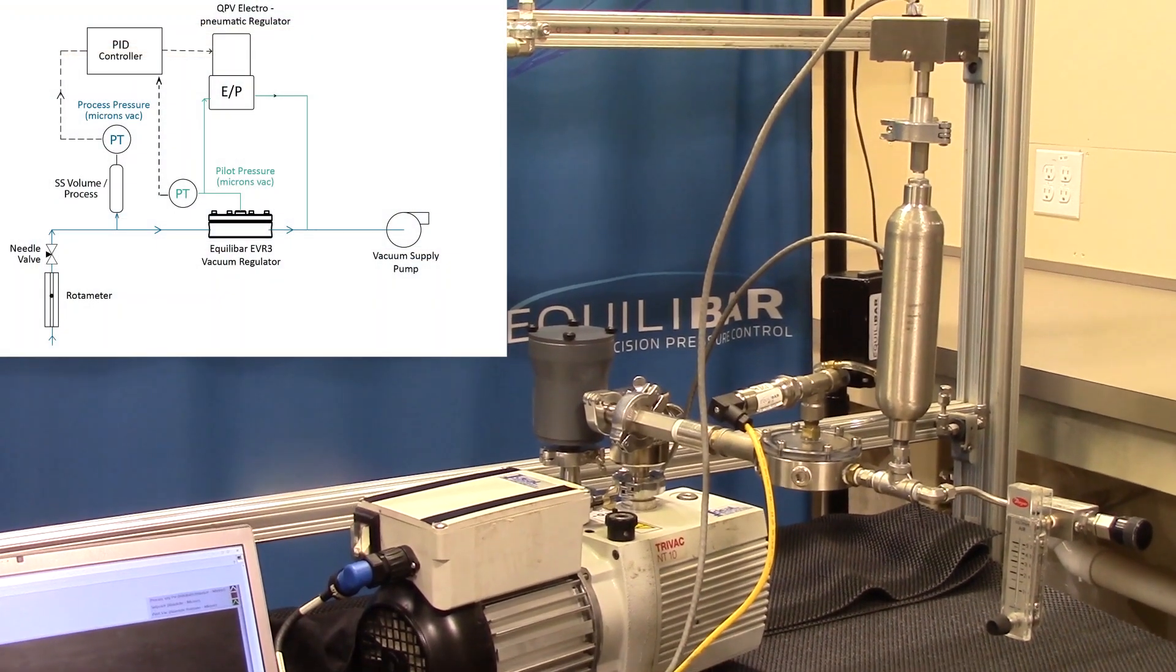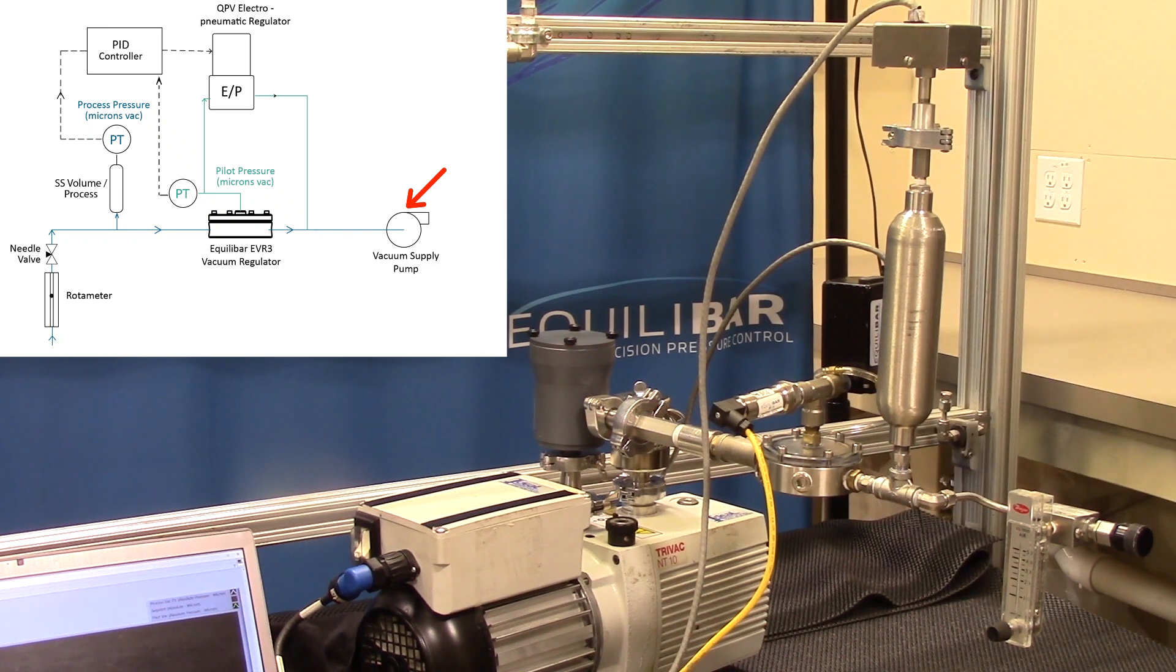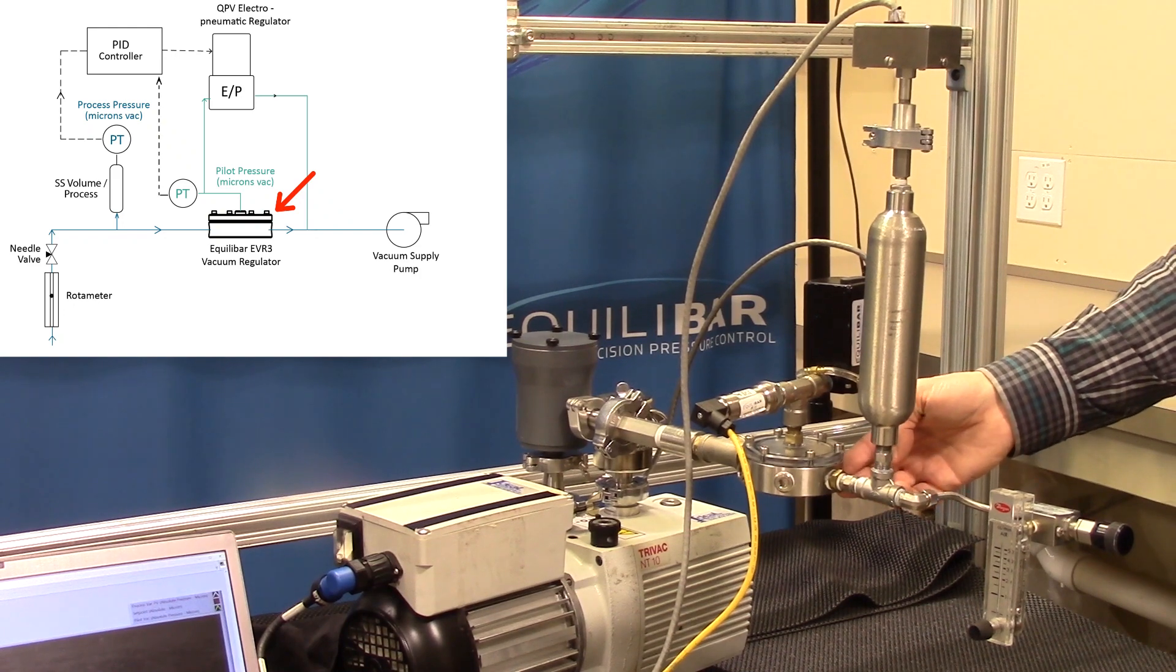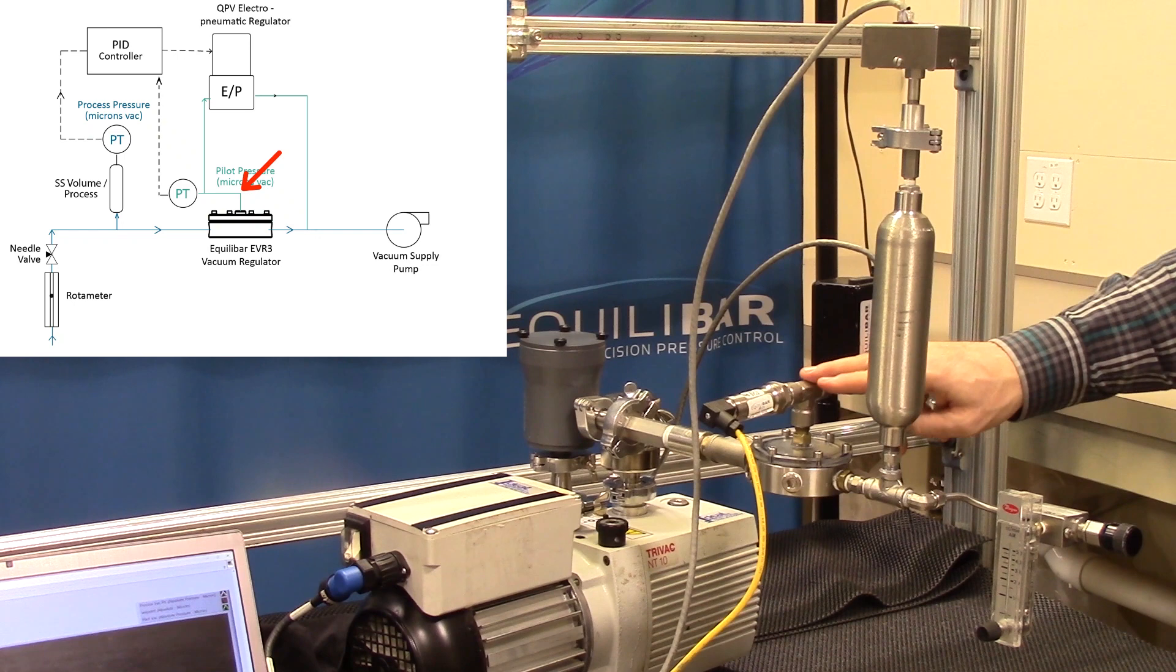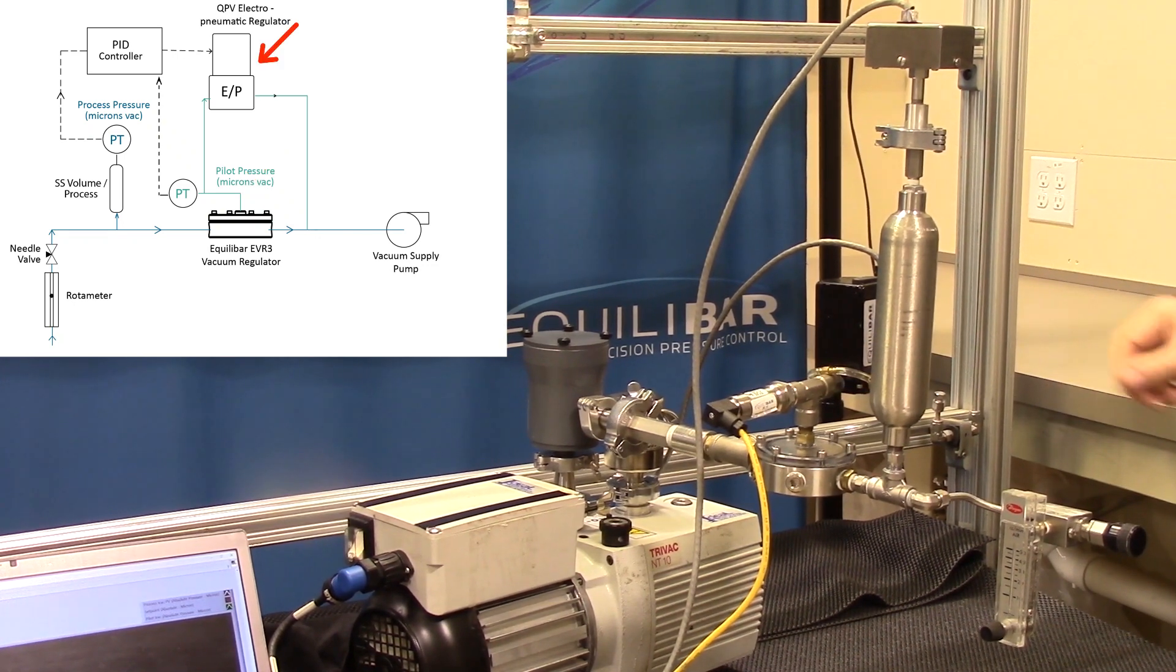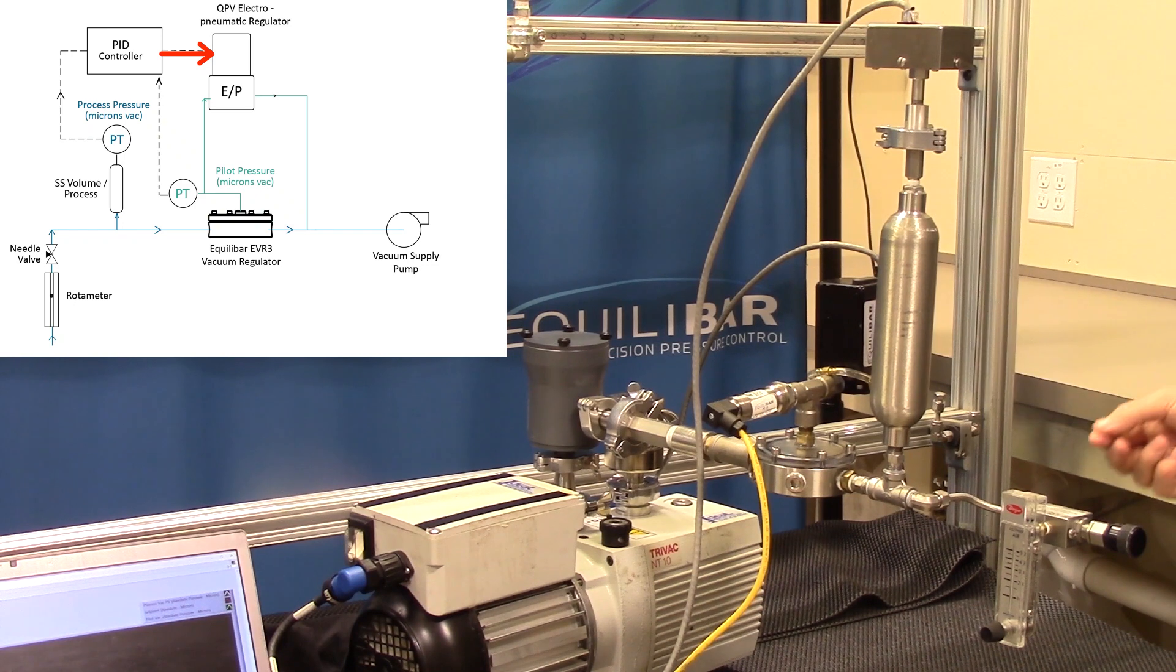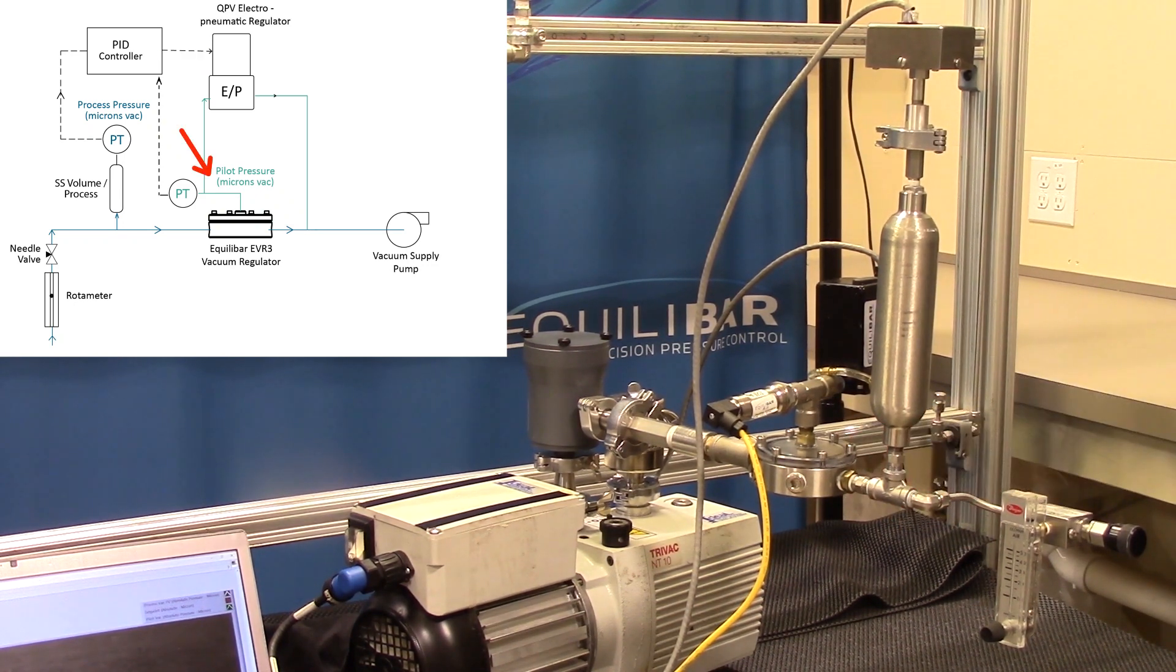Let's first look at the system setup. We will start with a vacuum pump such as this 10 ACFM oil piston pump. A stainless steel Aquilibar EVR3 vacuum regulator controls the vacuum process proportional to the vacuum pilot pressure on its dome. The pilot pressure is supplied by a QPV electronic pressure regulator which receives a command from the computer and produces a variable vacuum pressure to steer the Aquilibar vacuum regulator to its set point.